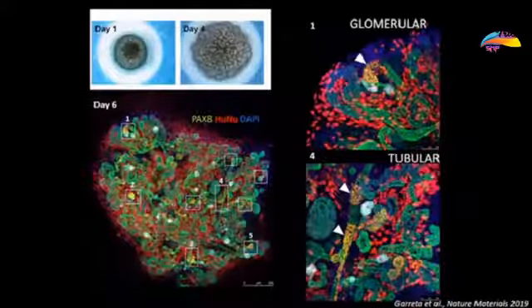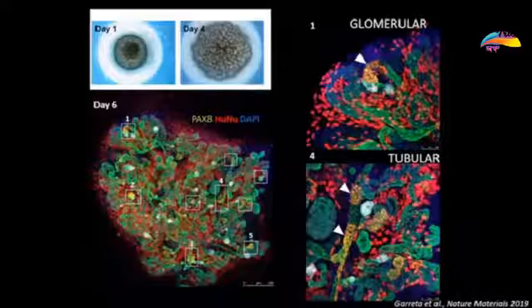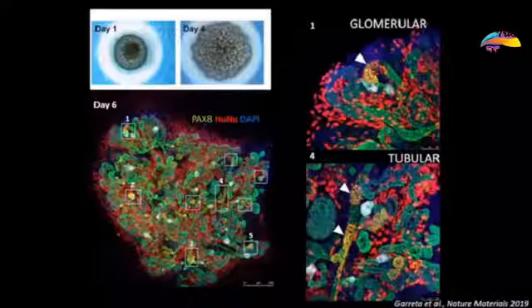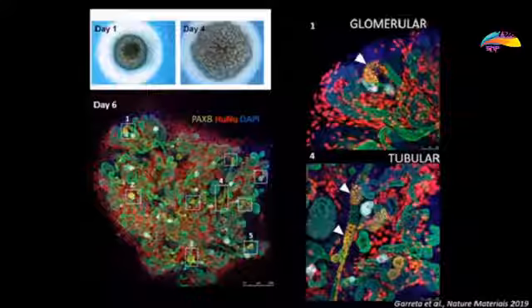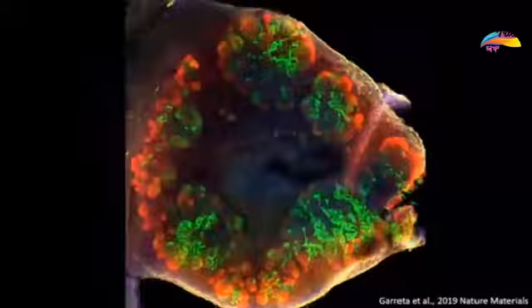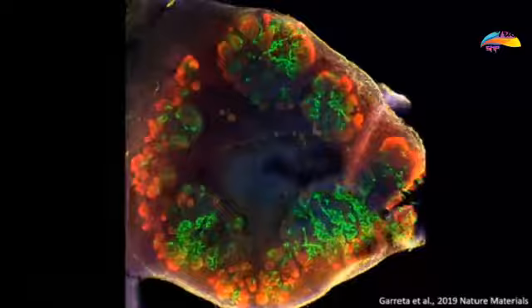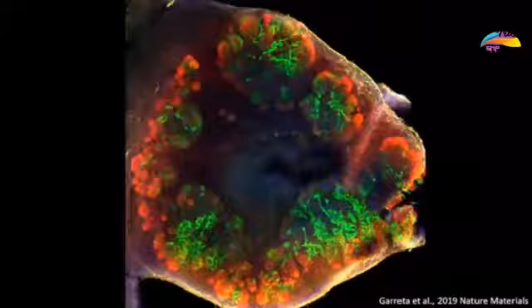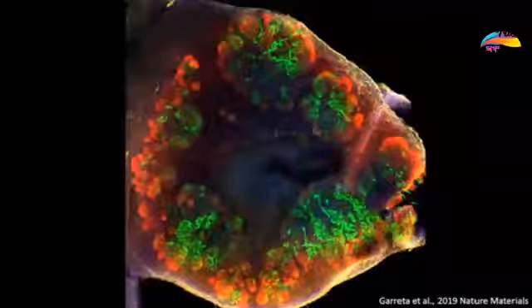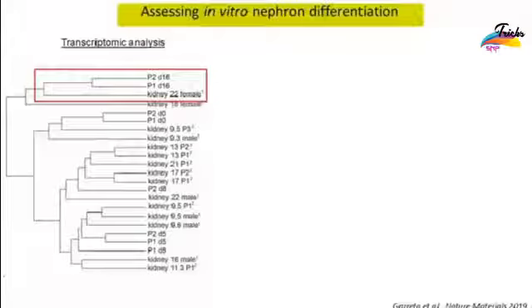Human cells were found in different structures in these reaggregates, and these results were further confirming the different progenitor cells. So we further proceeded and cultured these progenitor cells in a transwell system, and by 16 days of differentiation, we could obtain these kidney organoids.